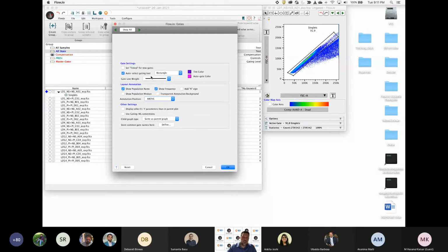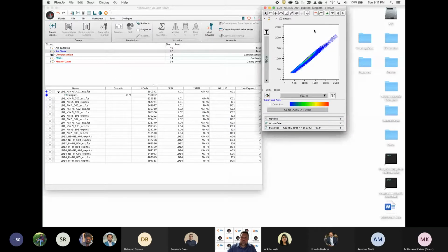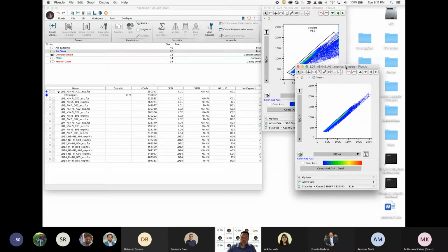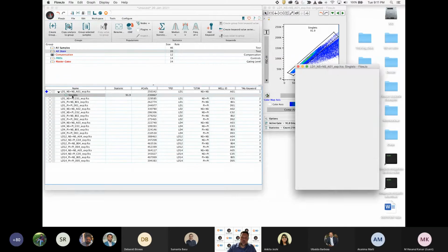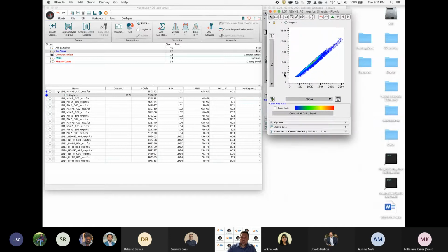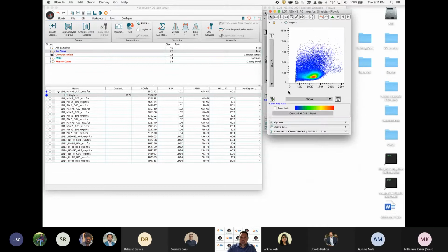So now that I've changed the tint color and made the gates darker, let's go ahead and double click on this population and move down into that subset. It opens up a new graph window with just those gated events in it by double clicking on the gated region. I can also open up this gated region over here within the gating hierarchy that's being created. Double click opens up those events. And then I can change the parameter that we're looking at. So maybe you want to go to side scatter now and do a kind of lymphocyte gate.